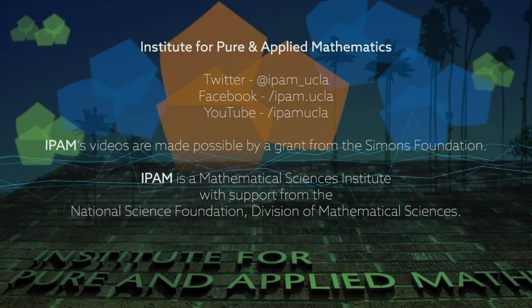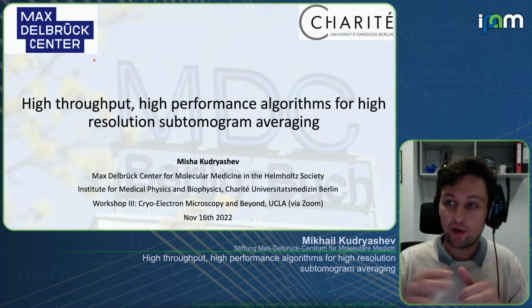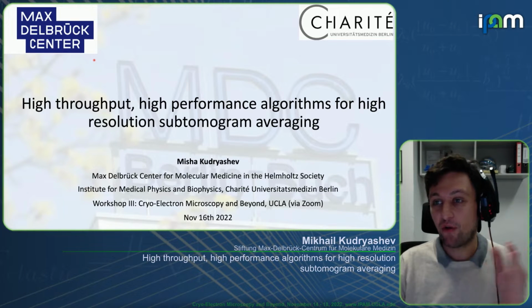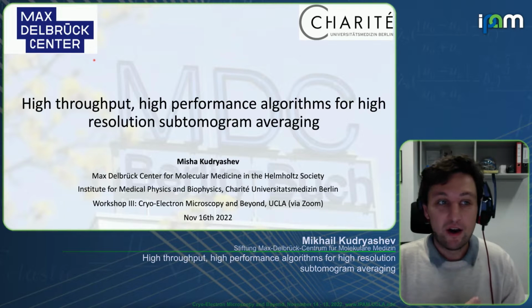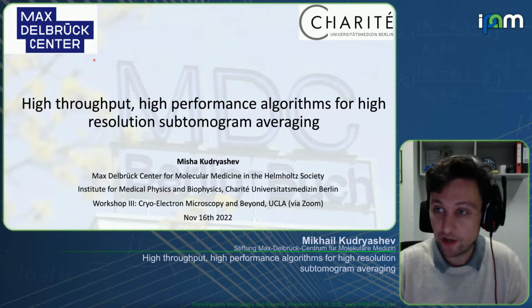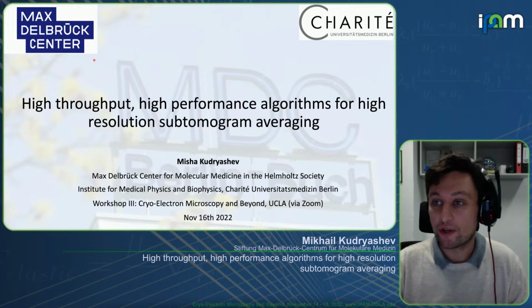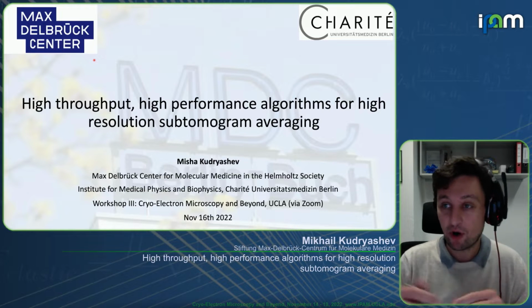So I wanted to structure it in two little parts. First one is a biological teaser, and I know that this is an Institute of Applied Mathematics, but I wanted to really show how we can get to high resolution for a real life protein. And then in the second part of my talk, which would be larger, and obviously we can maybe have more discussion on that, I would show what exactly we do and how we do this and how we think about subtomogram averaging and tomography.